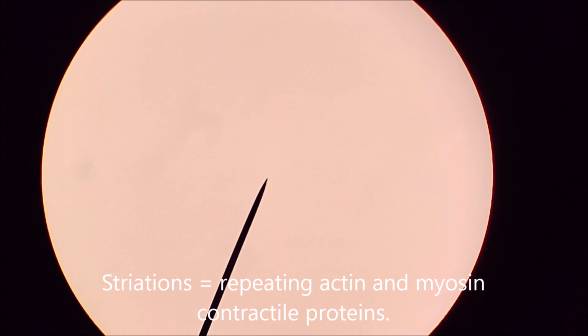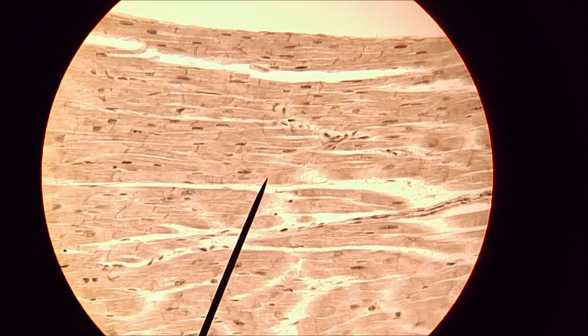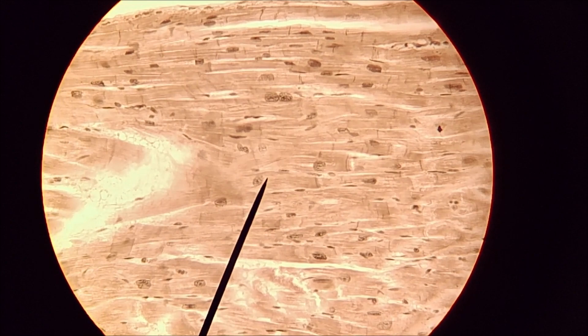Now I want you to compare that one to cardiac muscle. All right, let's zoom it in a little and see if we can find it. Oh yeah, that'll work just fine. You can kind of see the striations a little bit. I'm playing with the fine focus as we go.